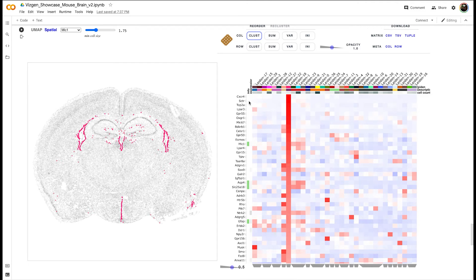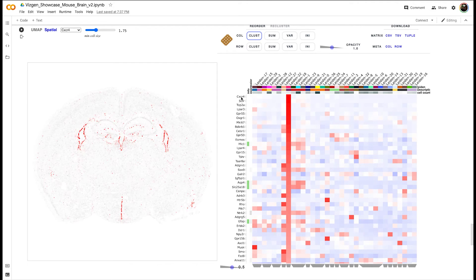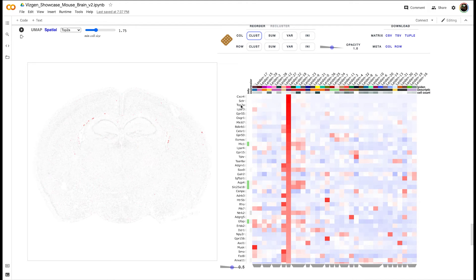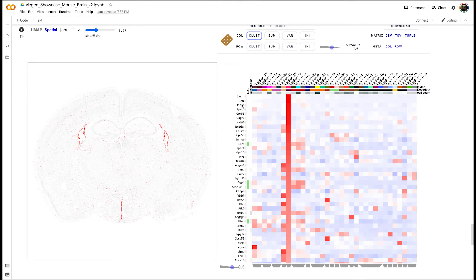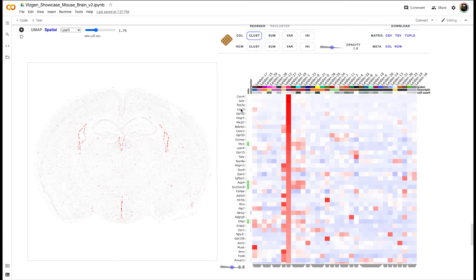We can also investigate other highly expressed genes like CXCR4, and you see that some of these highly expressing genes share very strikingly similar spatial localization to their parent cluster.